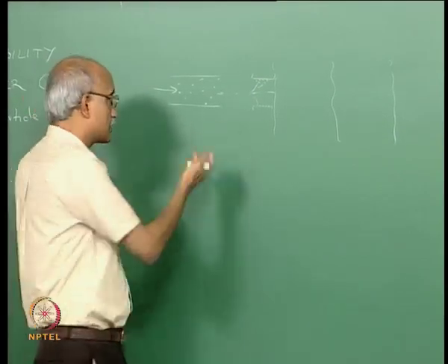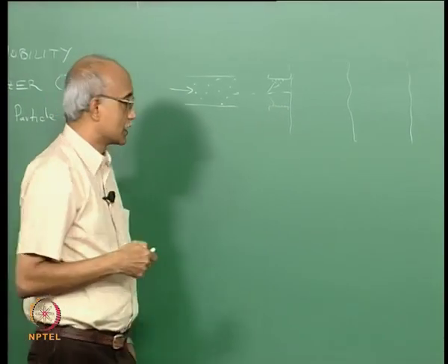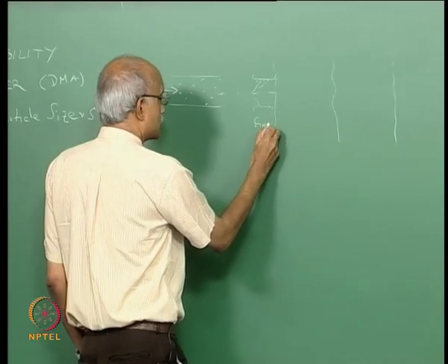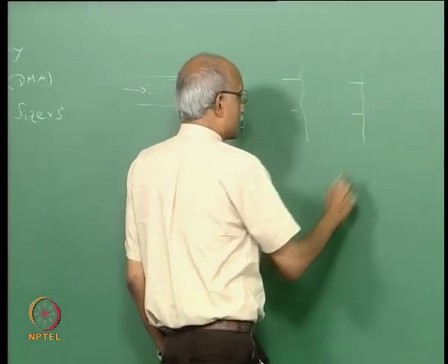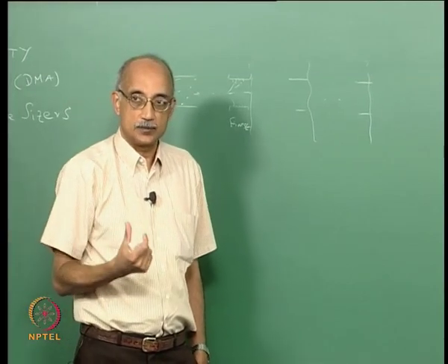So these are typically just stainless steel wire meshes that are set up at different sizes. So the finest particles will get captured in the first set of screens, and similarly you will have an arrangement that stretches all the way out to the coarsest particles in the stream.